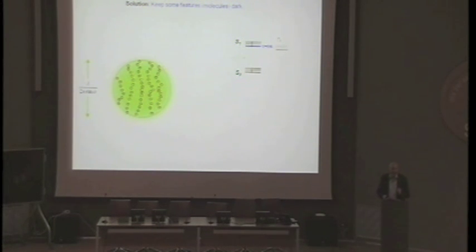And this is exactly the idea of this STED microscope. Now, in the STED microscope, we use a beam of light on top of this beam that has only one purpose. Make sure that not all the molecules that are flooded here with light, the green light, excitation light, are in the end capable of also sending light back.